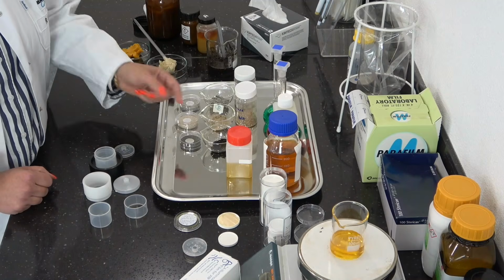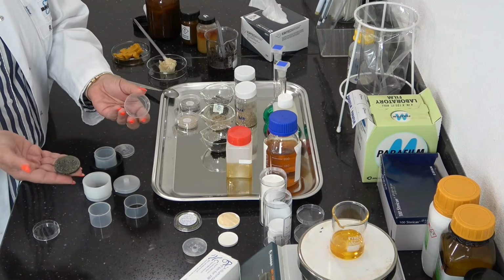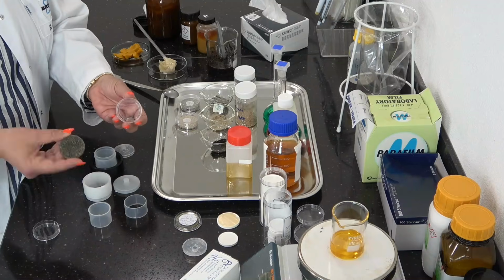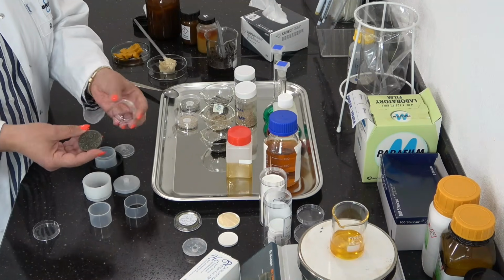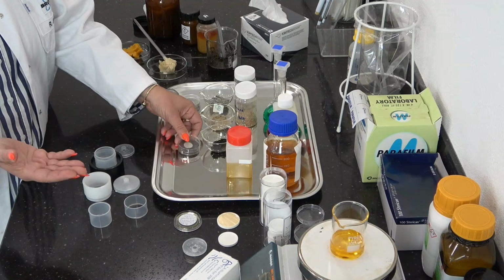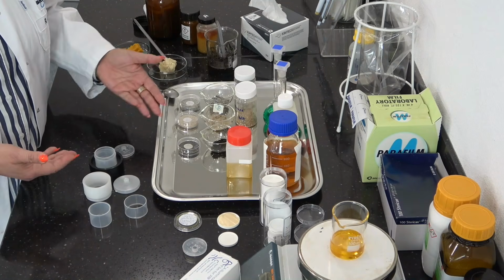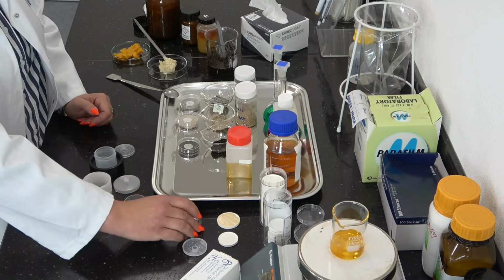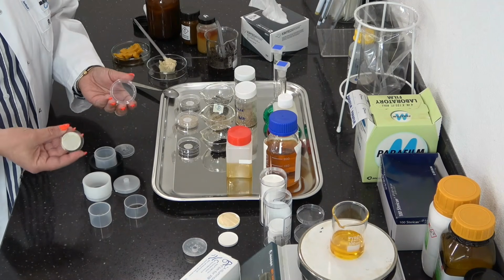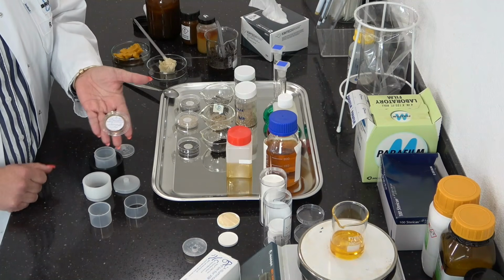On the other side, you can use the same powder. You can also prepare a press pellet. This is also very common. So this kind of material can easily be mixed with some wax. You can prepare a press pellet and you will get a very nice stable sample that can be analyzed also very quickly. The next step, if you really want to improve the results for main compounds, you can also make ash out of these samples, mix it with some flux and prepare a fuse bead. So this is much more time consuming, but this is also a possibility to get the best results for the main compounds.